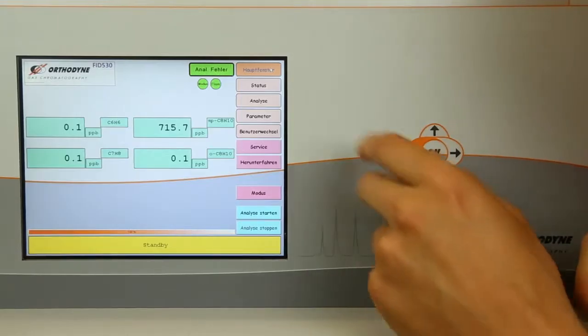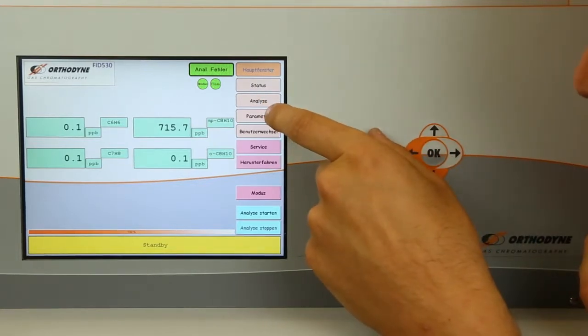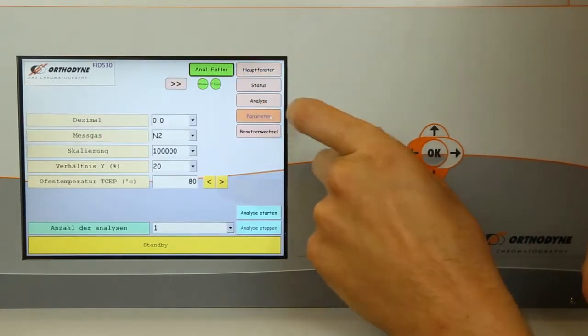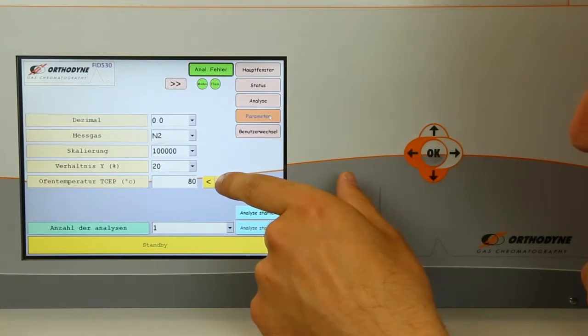Go to parameters and increase the temperature of the column. Leave the column at the regeneration temperature for 16 hours.